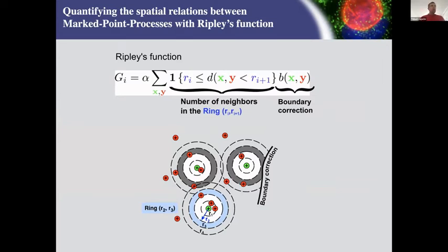And a very well-known and widely used process is the Ripley function, or here something that is related to the Ripley function. So the idea is to take, for example, the first object, the green one, and to count, at different concentric radii, the number of molecules that fall into the different annuli, or in 3D, the different spheres around the points. And so you will have a number. For example, you will have a mean number of 3 molecules at a distance comprised between 4 and 5 pixels.